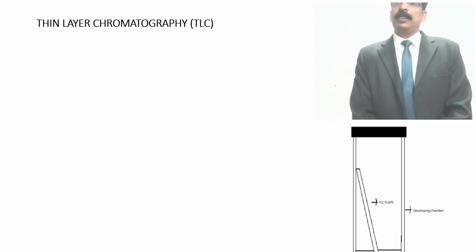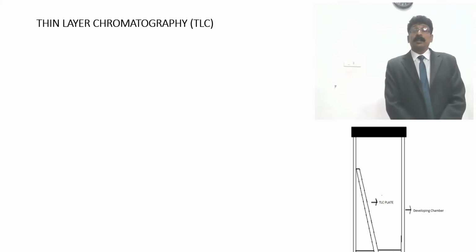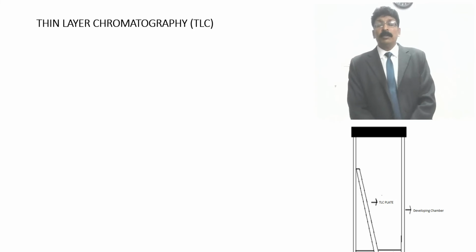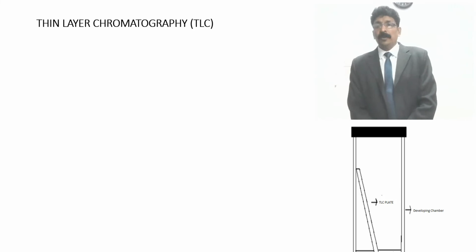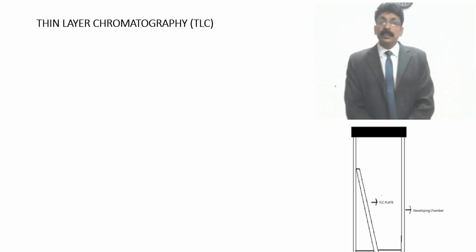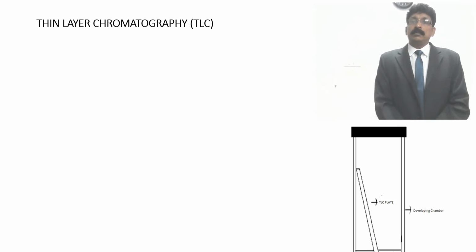Usually the qualitative test is combined with column chromatography, which we studied in the last class. We used to confirm the compound by using thin layer chromatography. So we should know the basic principle behind it. Even advanced techniques have been made now.